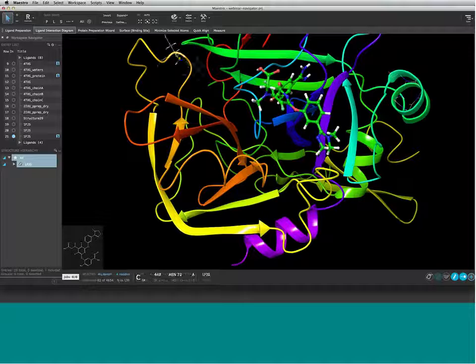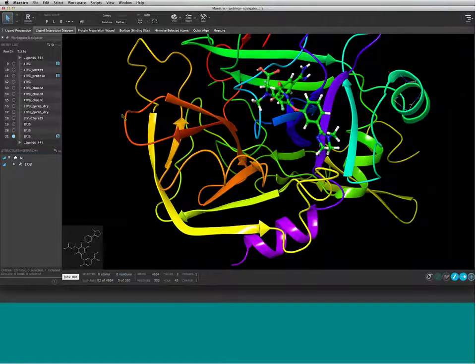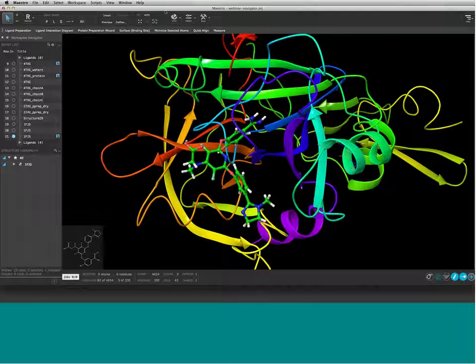And when you click, of course, you're clicking the entire residue. So you can go ahead and select all along the chain, all along the ribbon that way. And when you're in residue picking or higher, if you double click, it goes up. The atom picking will be working in the next release. So then you won't have to go into residue picking, except if you want to see this preview, which is very nice. So that is what I wanted to show you about selection, and I think I'm going to pass the presentership over to Robert now.